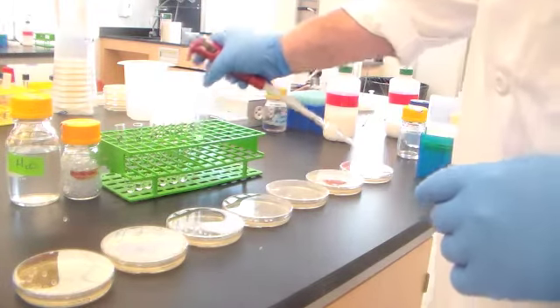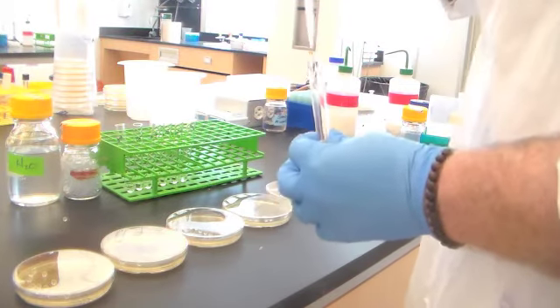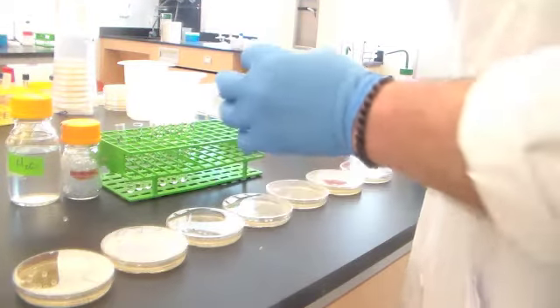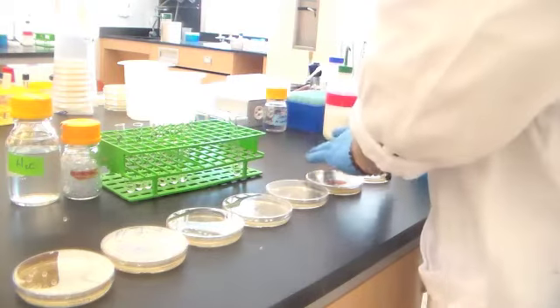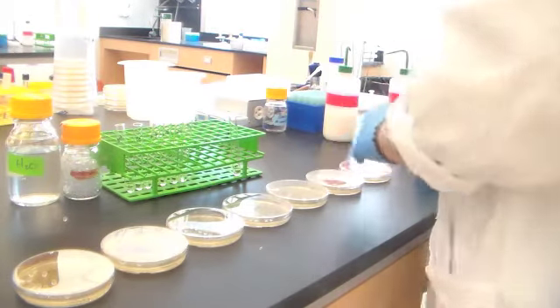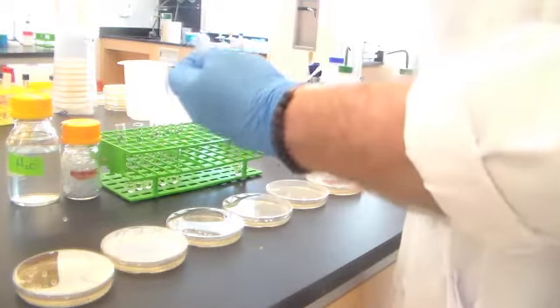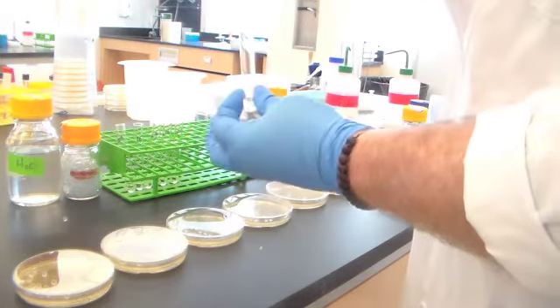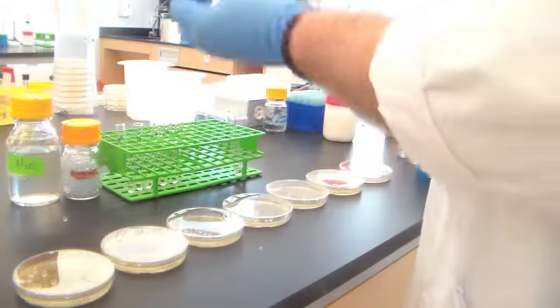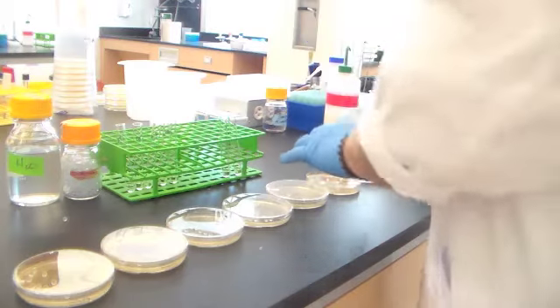What I'm going to do is I'm going to now start from the most dilute, the 10 to the minus 7th. I'm going to take 100 microliters from that very dilute. Perhaps there's not even any bacteria in there. And I'm going to plate that onto the 10 to the minus 7th plate that already has the beads. I don't need to change pipettes now because this had so few bacteria and this has 10 times more that if I go into this 10 to the minus 6 tube, I can use the same pipette. I'm just going to mix them up a little bit. Put that on.